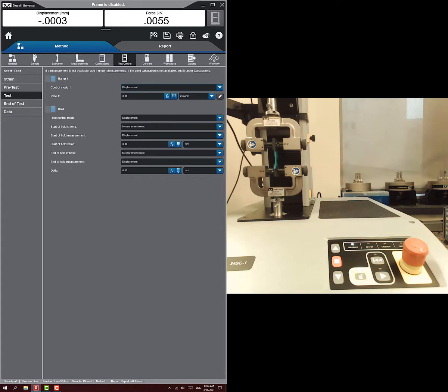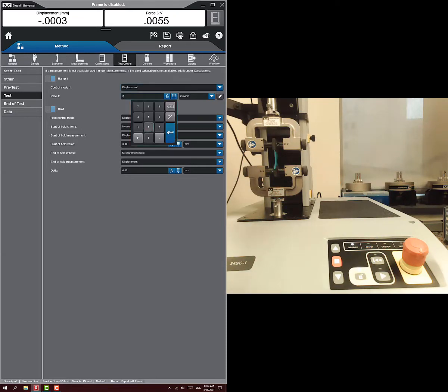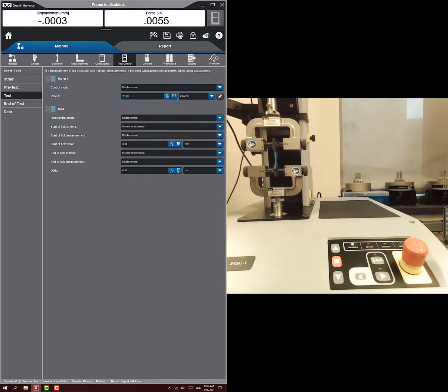That's what you're going to do with a stress relaxation test. You're going to ramp to some amount of displacement, and then you're going to hold it there and watch what happens to the force. So my control is going to be displacement again. Just like last time, we used 25 millimeters per minute for this rubber glove. That seemed to work, so I'll stick with that.